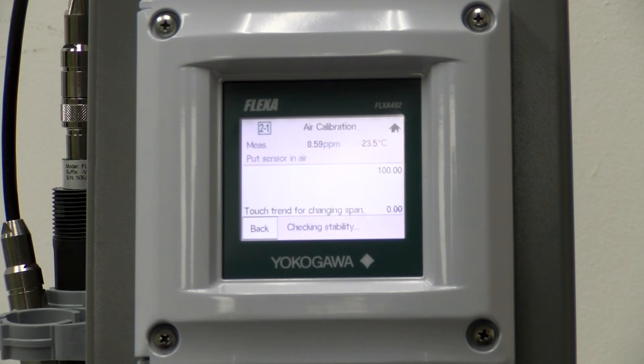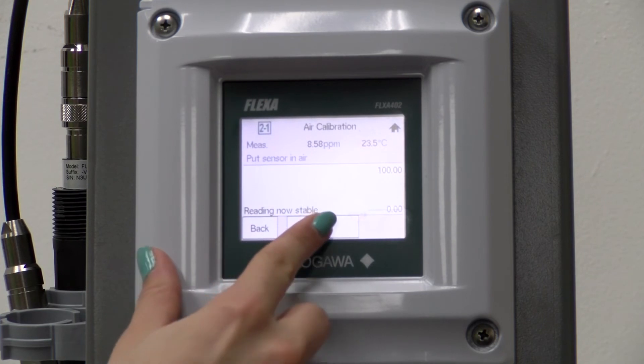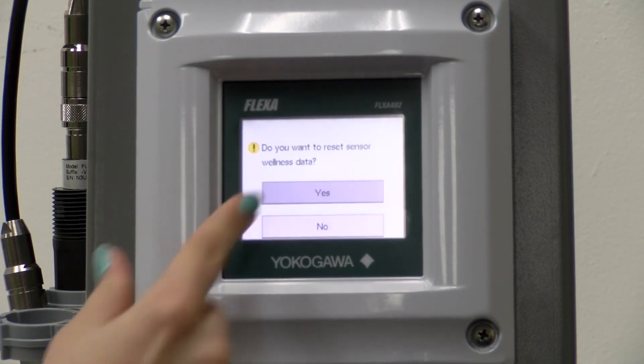It may take a little bit of time for the reading to become fully stable. After the reading has become stable, you are going to accept the air calibration by clicking next and then accept. If this is a new sensor, then you would like to reset the sensor wellness data, so we will click yes.